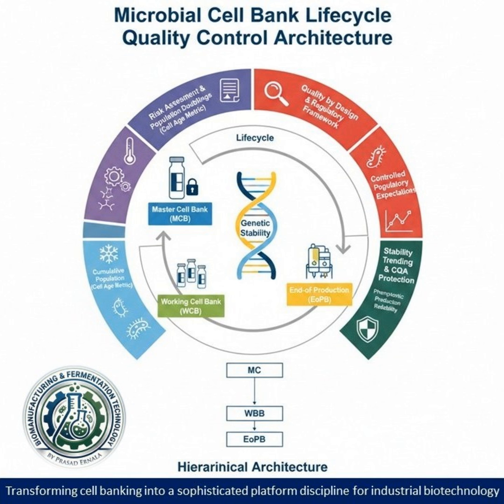Given these ultra-low temperatures, a freezer failure has to be the nightmare scenario. It is the single most terrifying thing for a bank owner. Your freezers and LN2 tanks must be qualified, temperature mapped, and have continuous monitoring with alarms, backups, the whole nine yards. But the key is the written procedure, the excursion governance SOP. What needs to be in that SOP? Everything. Explicit alarm thresholds, like minus 60 degrees is the action point for a minus 80 freezer. And crucially, you need clear criteria for vial usability after a short excursion.